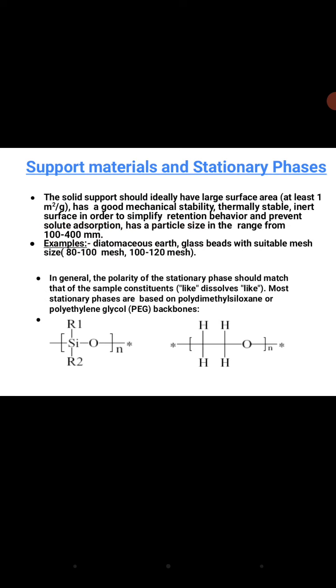In general, the polarity of the stationary phase should match that of the sample constituents. Most stationary phases are based on polydimethylsiloxane or polyethylene glycol backbones. These are the diagrams.